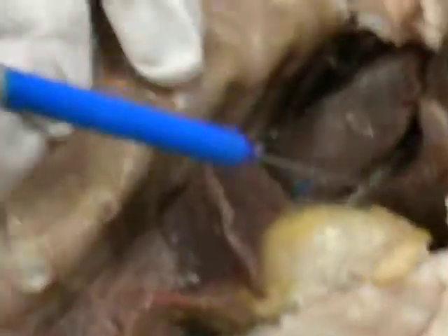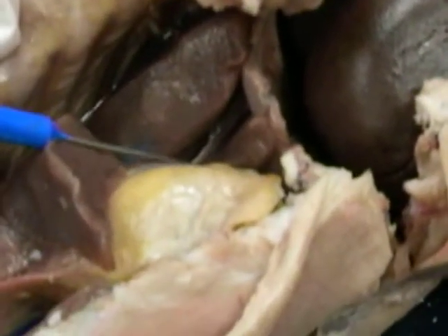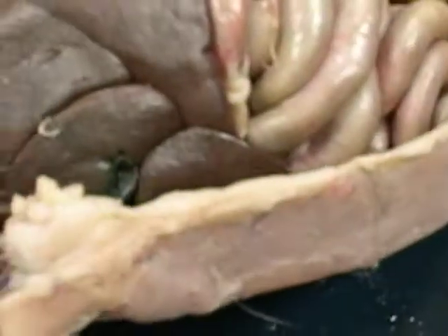And they also have an extra one. Well, we don't have this one either, but it's smack dab in the middle. It's the mediastinal lobe right here. Again, extra. Diaphragm right underneath that. We have the big liver. Got the gallbladder, that green thing right there. Spleen.